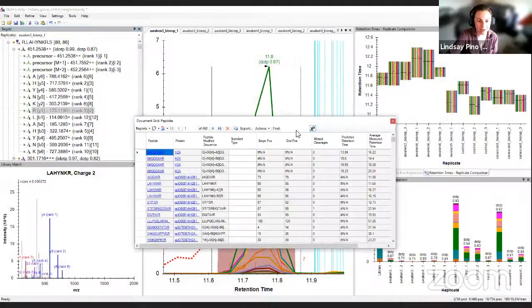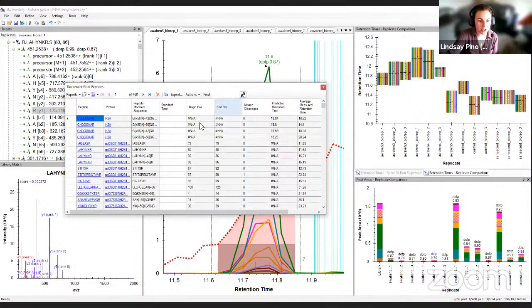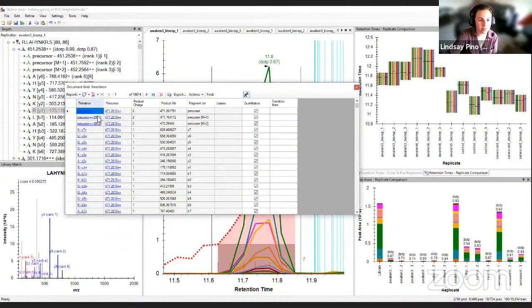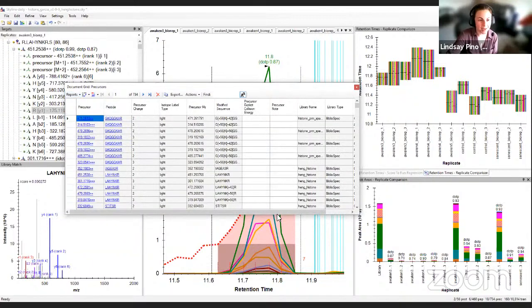So we've got like 1 more minute. Let's see if I can real quick. So if you did that view document grid, you could potentially use some of these values in the document grid. There's average retention time, but there's a whole bunch of other values that you can play with in here. So Juan is kind of getting at the idea that you could probably use some of these metrics in the report to refine using this kind of data. It's not a single button though, unfortunately.